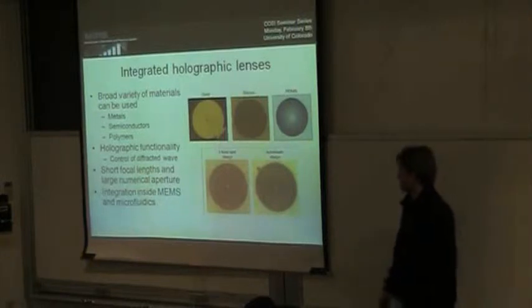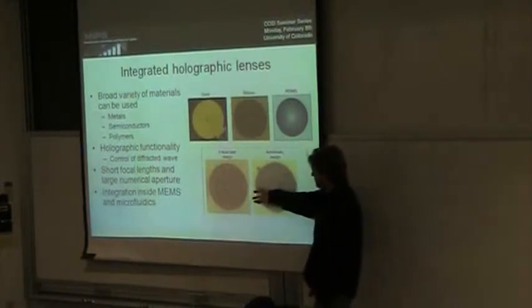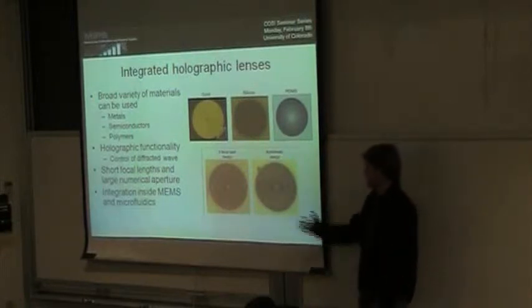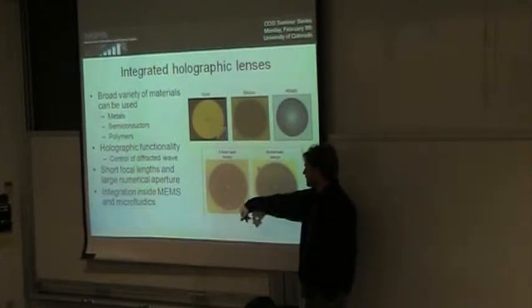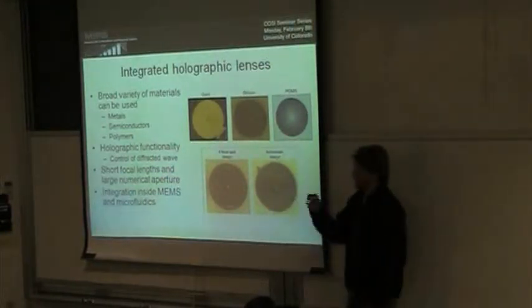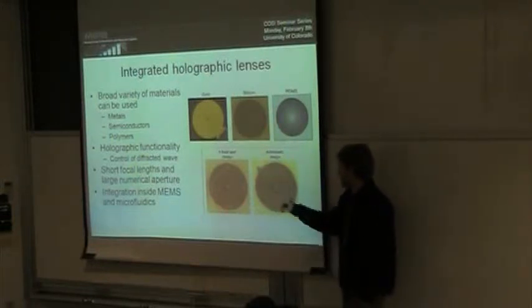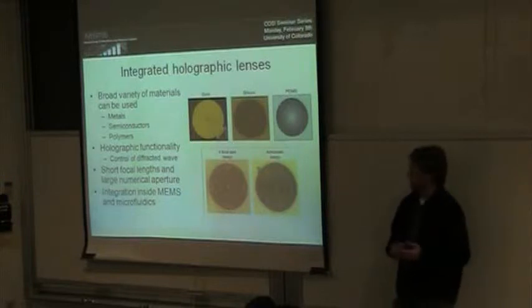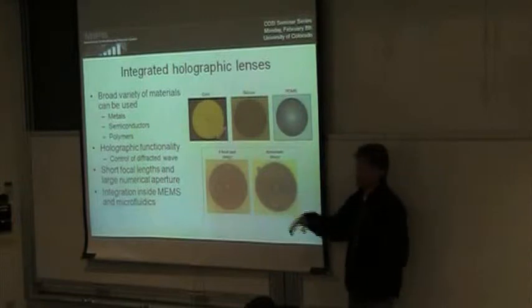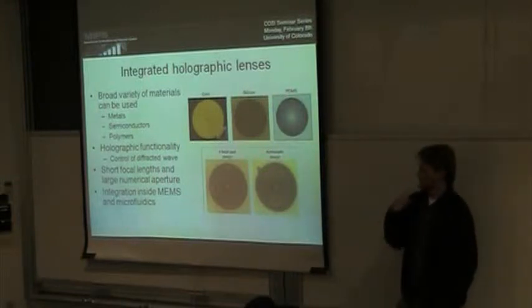And then future designs are going to take advantage of the fact that you can pretty easily integrate these systems with various holographic functionality. These are just two designs that we made for the trapping project, which this lens creates 4 focal spots that is able to trap 4 particles simultaneously. And this lens, so the trapping laser was 980 nanometers, and we designed a lens that would focus 980 nanometers to the same spot as the fluorescence emission, which happened at 575 nanometers.